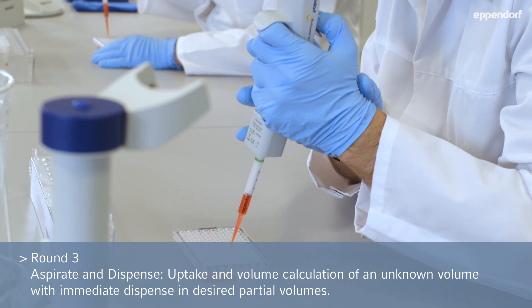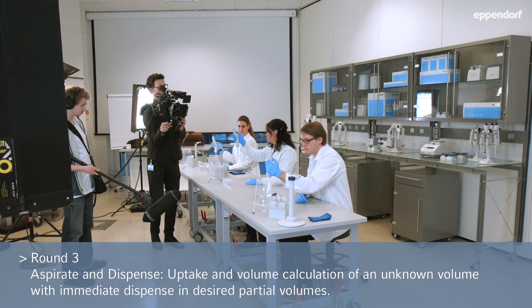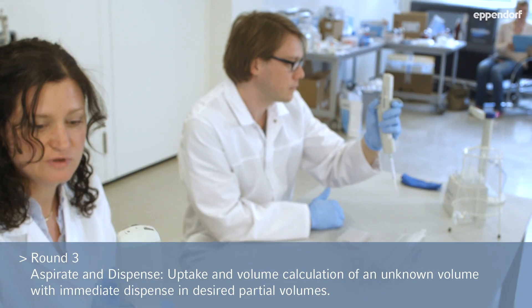Very good. Press twice to dispense the rest. Ready.